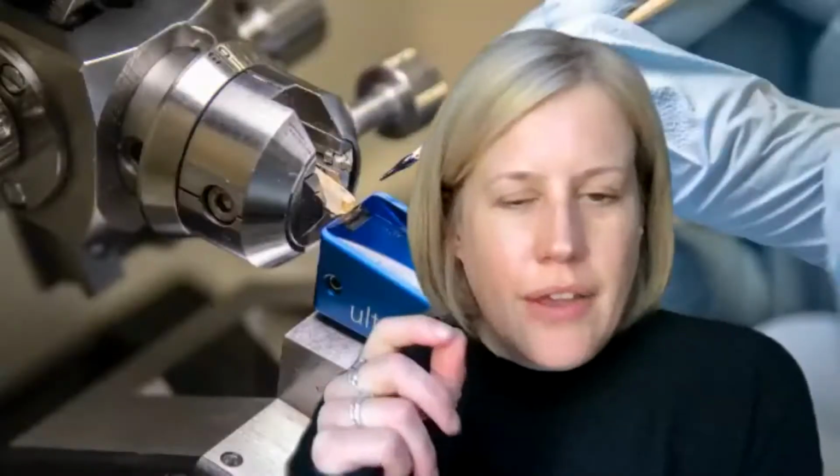So, I mean, everything is just wonderful to see. I'm especially curious about the InResin fluorescence. I mean, as you say, the precision there, given everything that you just made a comment about how super resolution is still getting there, the ability to have precision is really where we have so many people coming to us and just sort of tugging on our elbows for a little bit more. Where do you feel the InResin fluorescence is in terms of, is this something where we can start applying it in a routine way to people's samples, or does it still really require a lot of refinement to work out the tweaks? I think it's very close.